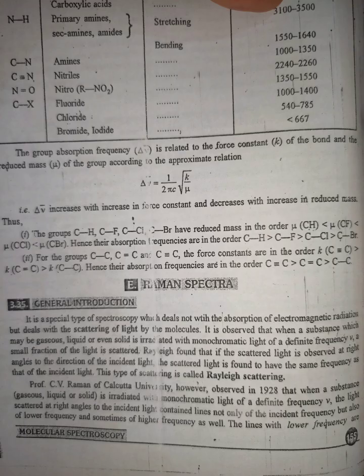General introduction. It is a special type of spectroscopy which deals not with the absorption of electromagnetic radiation but with the scattering of light by the molecule. It is observed that when a substance, which may be gaseous, liquid, or even solid, is irradiated with monochromatic light of a definite frequency, a small fraction of light is scattered.